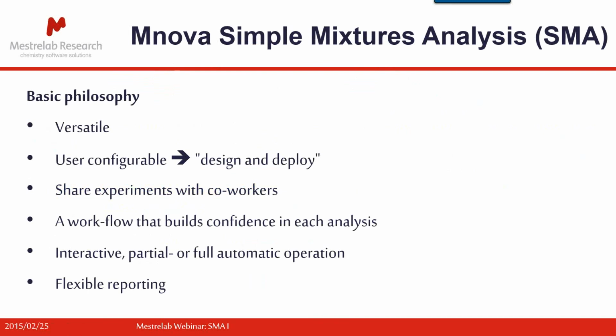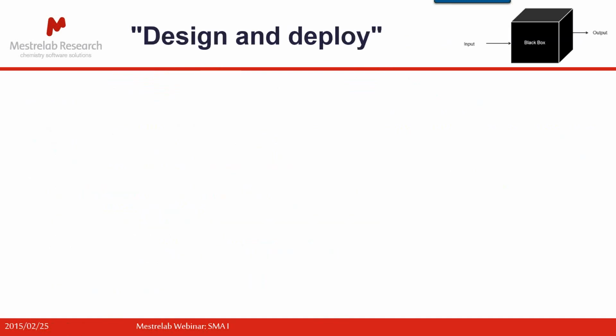Now, everything I'll be doing today is in an interactive fashion, but you can use SMA in partially or fully automatic operation, as I'll hint at the end. And we have some flexible reporting tools available to you at the end of the whole game. So we come to this design and deploy approach.